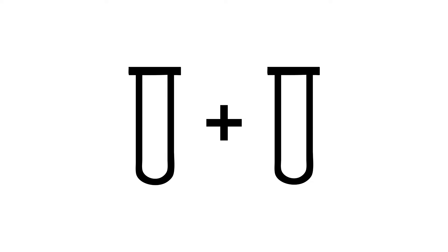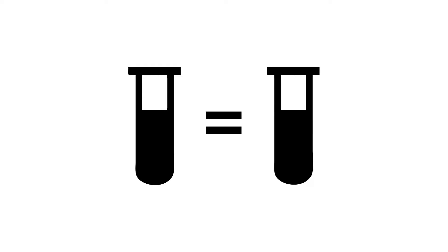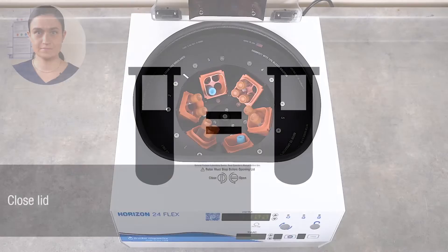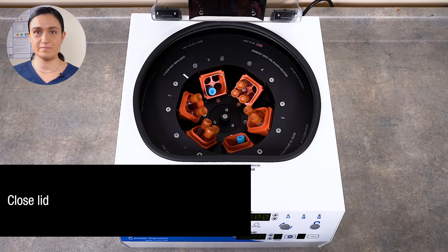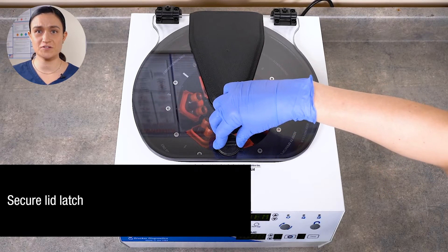If you don't have enough tubes to balance your centrifuge, you'll need to create a stand-in to fill the gap — we call this a counterbalance tube. This should be an identical tube filled with an equivalent volume of water as the blood tube that it will match. If the volumes are equivalent, the weights should be too, and you'll get the balance you want. Use your filled counterbalance like a regular tube to get your balance. With your tube holders in place and your samples loaded and balanced, you're ready to spin. Close the lid and secure the lid latch by pressing it down gently and turning it a quarter turn clockwise.